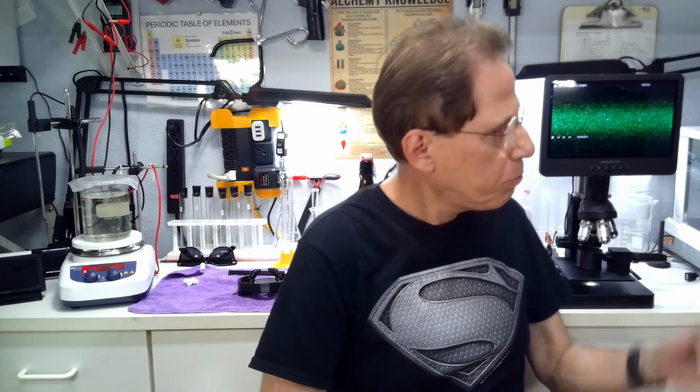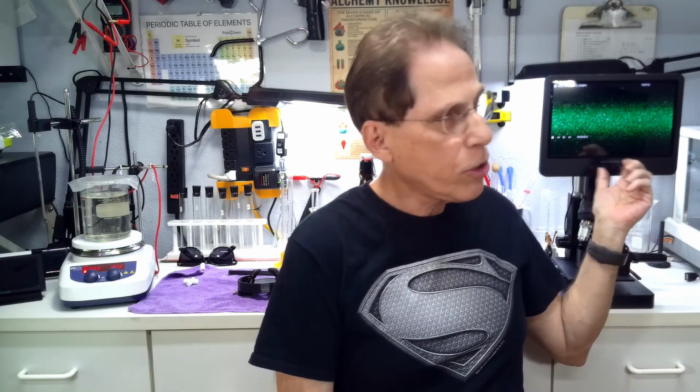And I haven't quite figured out how to do that yet, because everything is referenced to parts per million, in a sense. But right now, my best I can do is I'm saying that this is equivalent to 24 parts per million silver, using silver as a baseline for now as far as concentration goes. So we'll have more on that as I develop that, so that when I show you an image, you'll say, oh yes, that's an X amount of concentration.